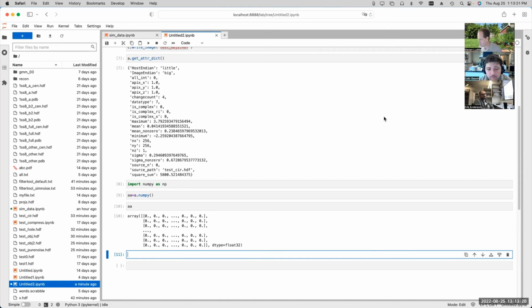If you put it all in the same file, then you would have to have software which said, you're asking for this type of image from this HDF file. And then you'd have to integrate that into your entire pipeline, right? Whereas if you just keep the files in organized folders, then you don't have to worry about any changes to the software at all.